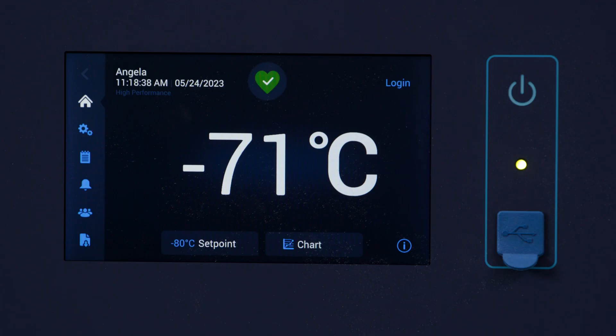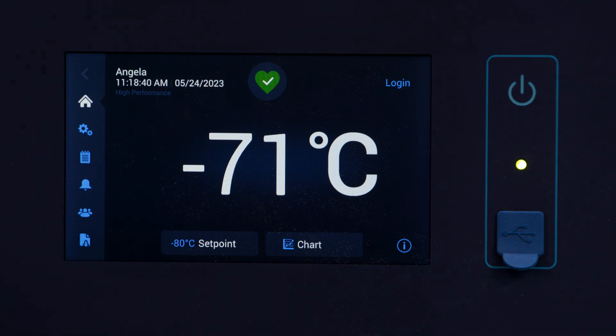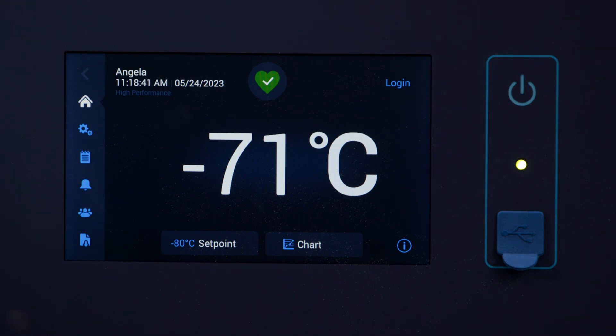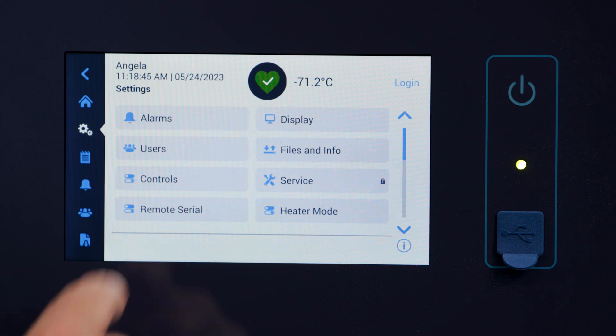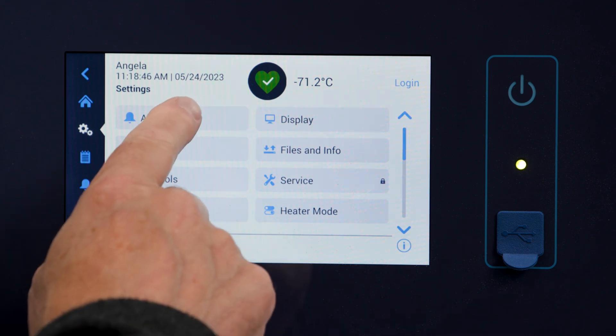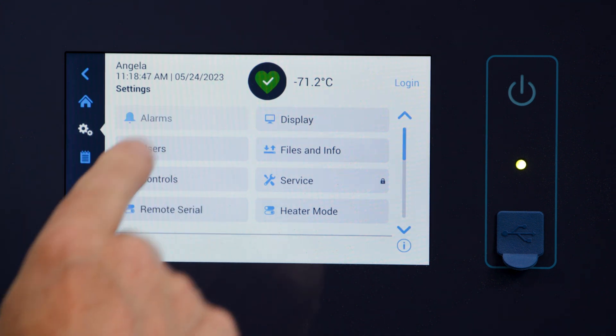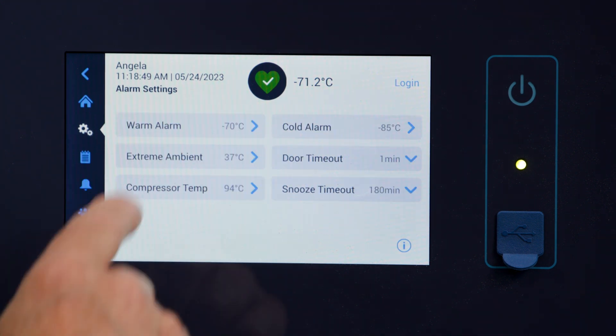Let's look at the user interface, commonly referred to as the display panel. To get started, first click Settings, then click on the alarm tab and choose the warm alarm.